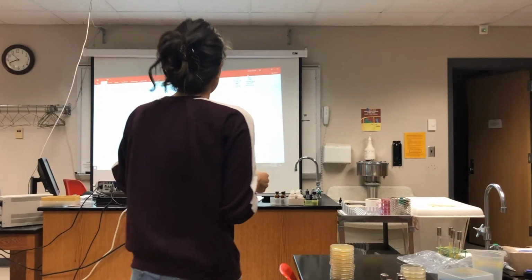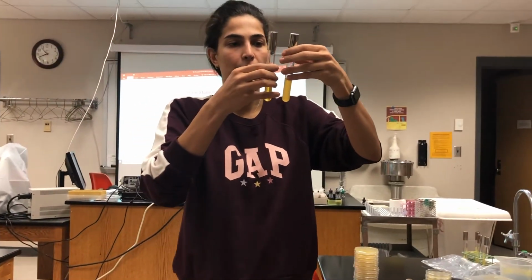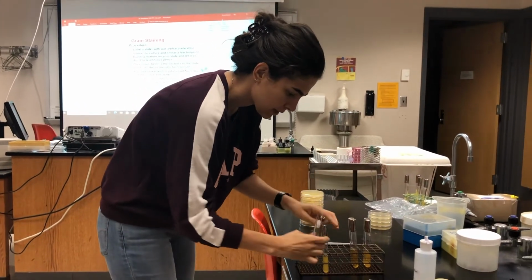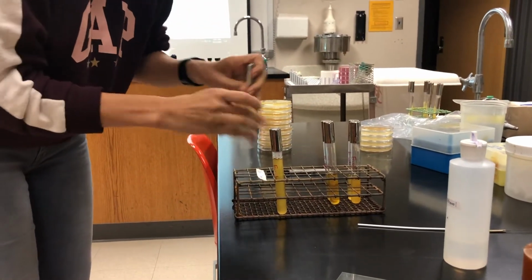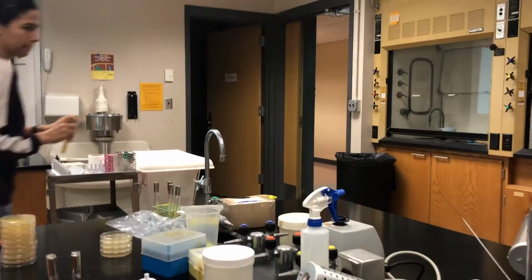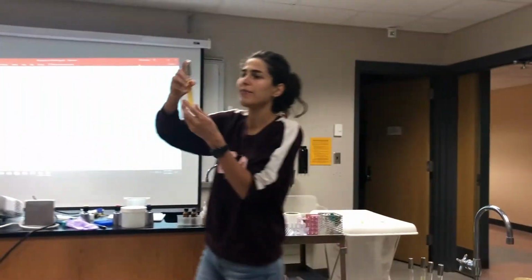Then what should we do? Vortex the culture and smear a few loops of bacteria mixture. So here is the bacteria mixture, E. coli and Staphylococcus epidermidis. I will mix these two because we want to have the mixed culture. After I mix it, I need to vortex it. Okay, now we have the mixture. Oh, we have a lot, we don't need it.